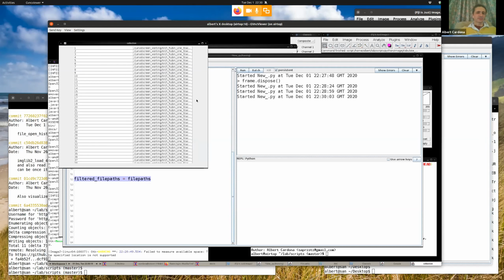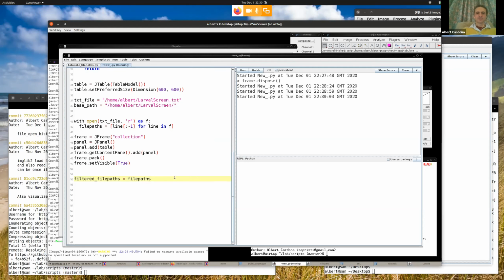But you'll notice other things. For instance, there's no scroll. We cannot scroll the table yet. We gave it a raw table with more rows than fit in the screen. That's not a good idea, right? So let's close that. How can we fix that problem?